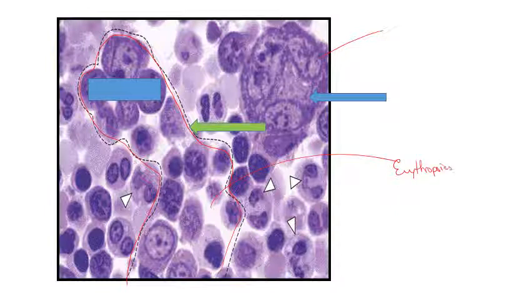So all these cells, thank God that you don't have to know each one of these different maturation points, but these are going to be where our red blood cell is undergoing erythropoiesis and slowly but surely trying to kick out its nucleus and mature. So right here we have a neutrophil, another neutrophil, lymphocyte, neutrophil. Okay, so you get the point. You can identify some of these cells in their earlier stages.